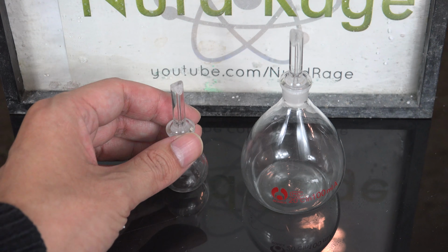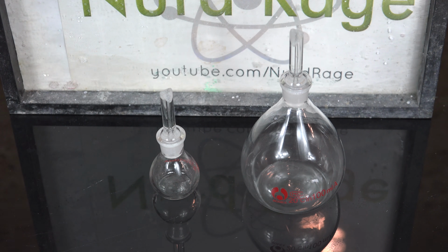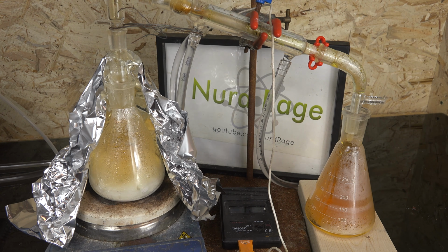If you are getting them, I recommend getting a couple of different volumes. A large volume for high accuracy when you have large amounts of sample, and a small volume when you don't have that much sample to use. For example, when I'm making nitric acid, it's far more convenient to test a small 10 milliliter sample, despite the accuracy loss, than a 100 milliliter sample.